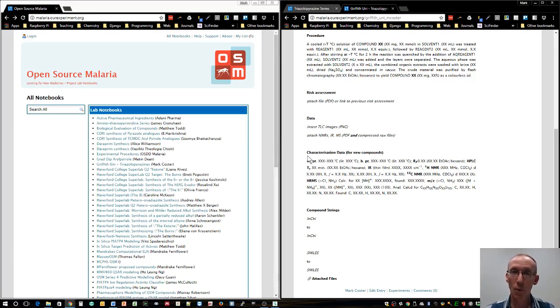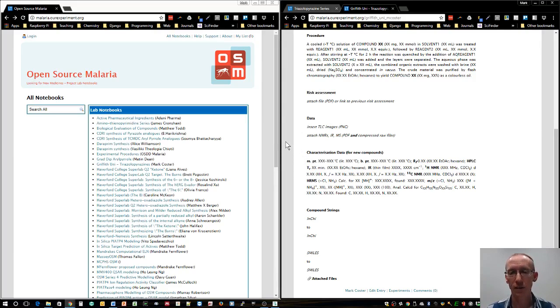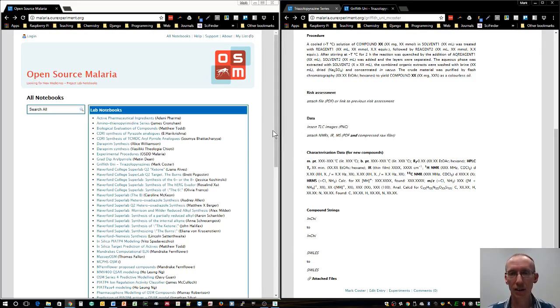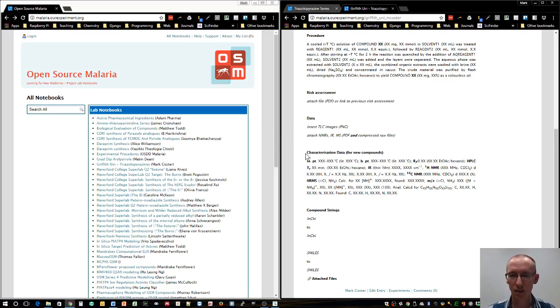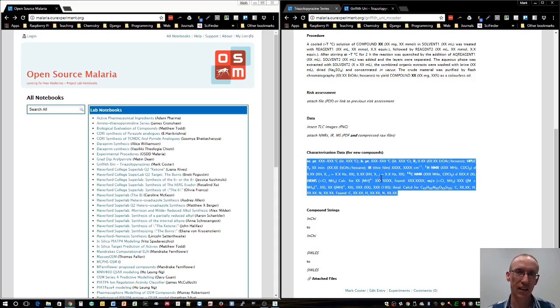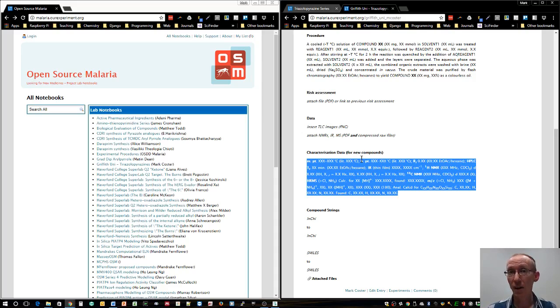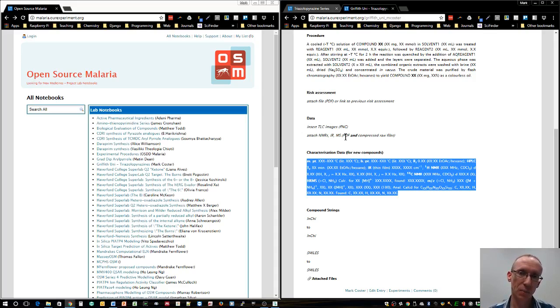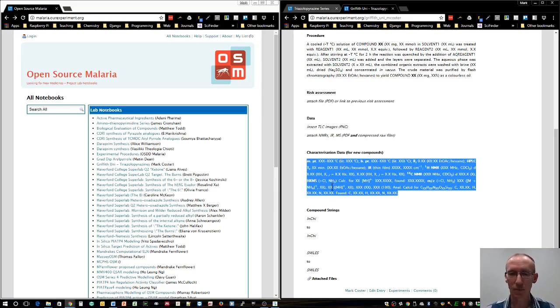But when you get to new compounds, new territory, it's really important to fully characterize these with data such as proton NMR, carbon-13 NMR, mass spec and so on. You can see an example layout of how to set that up according to the standard used in most major chemistry journals and in honors and PhD theses.